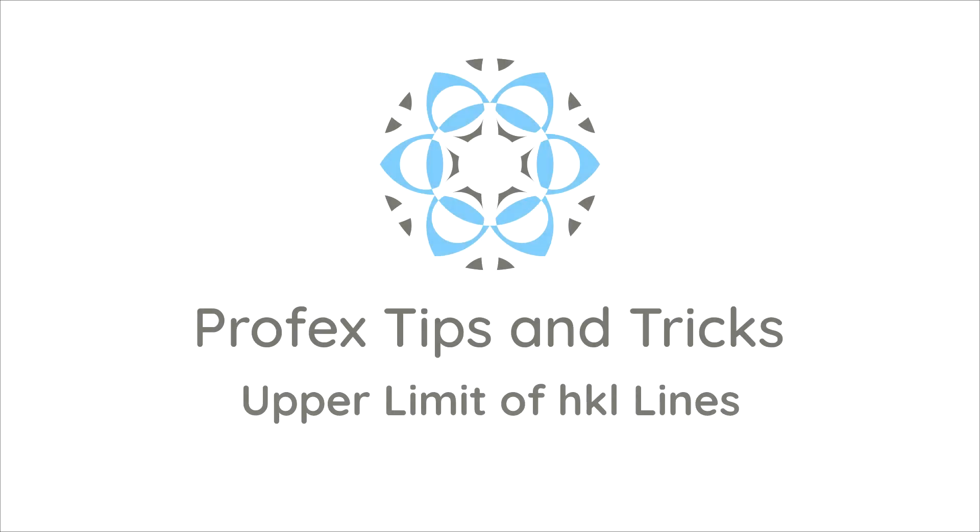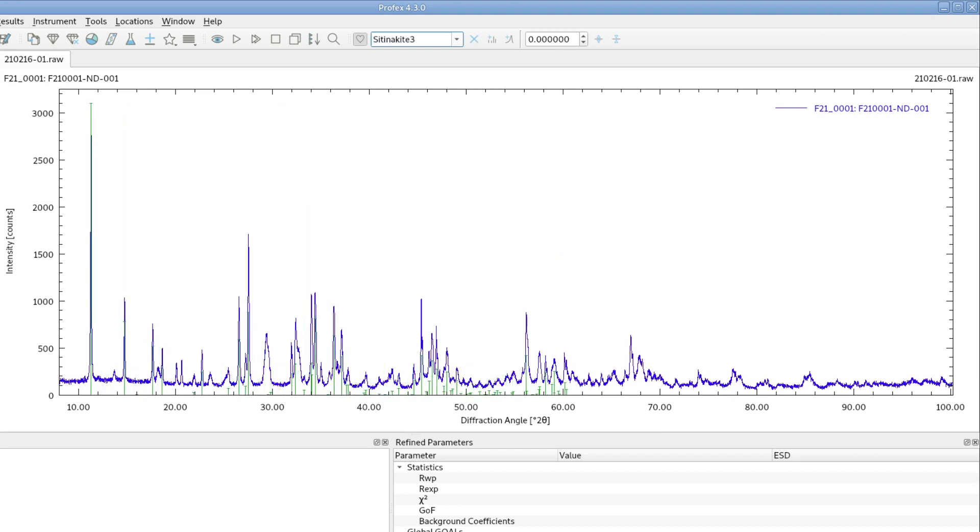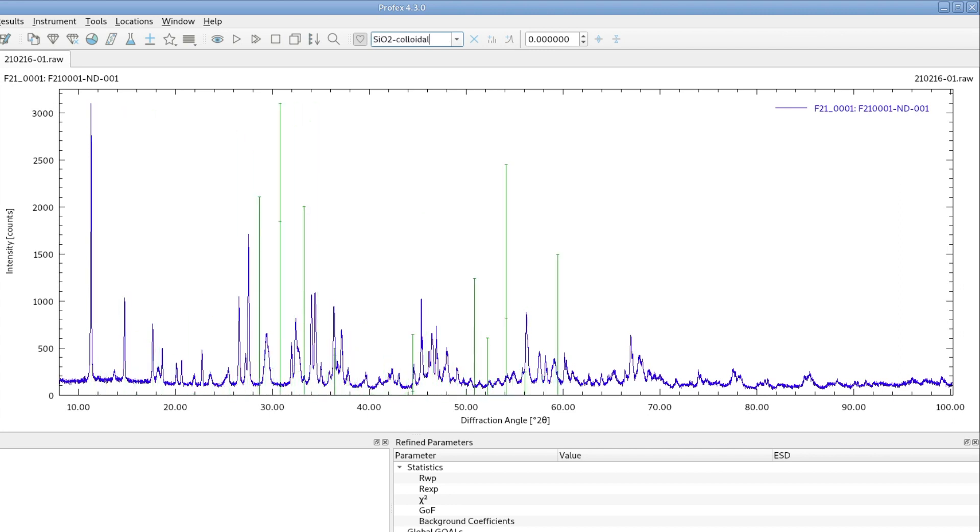Hi there! I'm sometimes asked why the HKL lines of the reference structures are only calculated up to 60 degrees 2 Theta. So as you can see, no matter which structure I select, it only has lines up to 60 degrees.